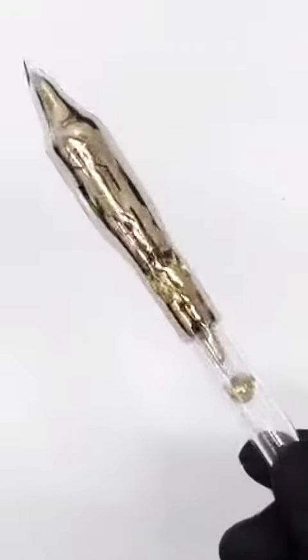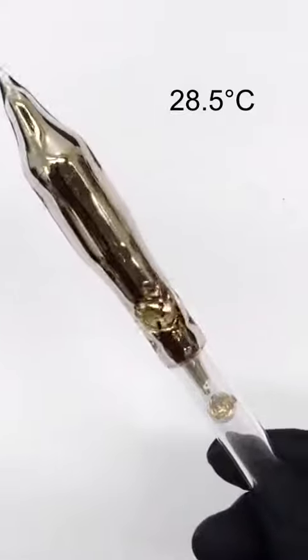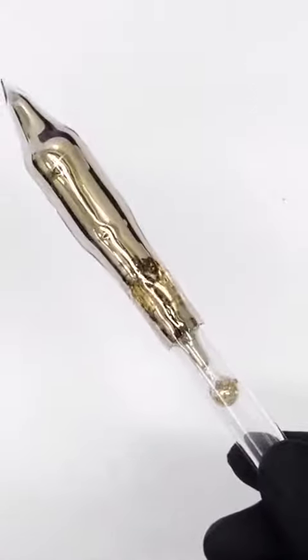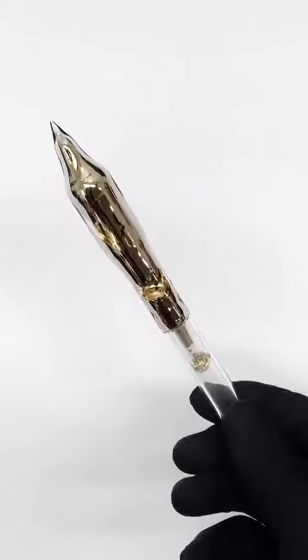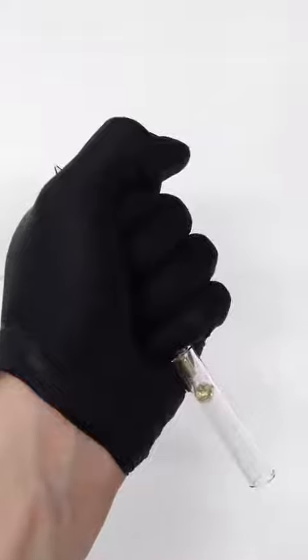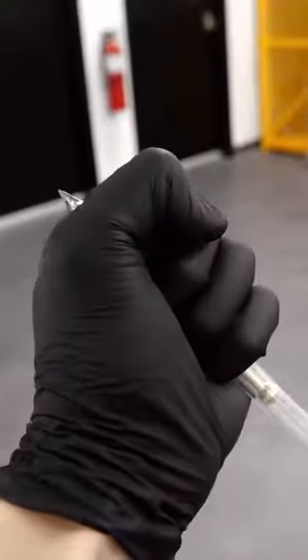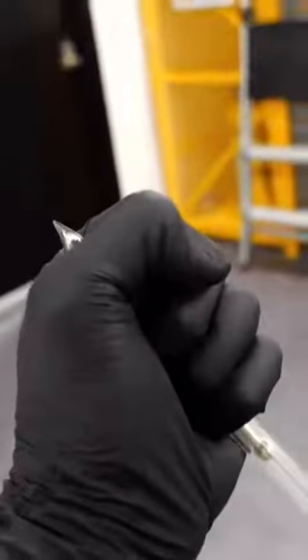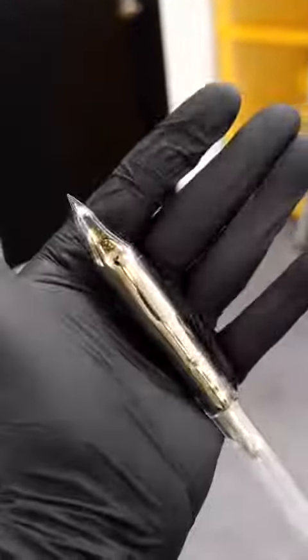The melting point of cesium is only about 28.5°C, or 83 Fahrenheit. This makes it extremely close, but not quite a liquid at room temperature. If I hold it for another minute or so, I can completely liquefy it. I just have to be really careful though, because dropping it in its liquid form would be an absolute disaster.